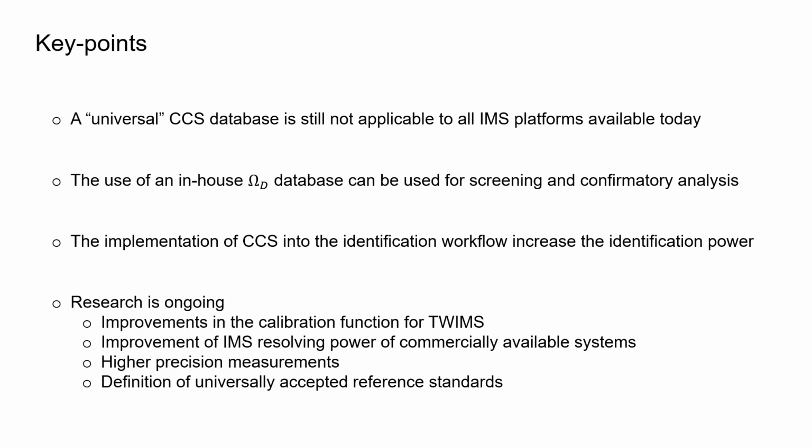Lastly, research is definitely ongoing and significant progress is expected very soon. For example, in the improvement of the calibration equation for the traveling wave, or even a first principle equation for the direct CCS derivation for the traveling wave and TIMS. Improvement of the resolving power of commercial systems is also expected. The recent launches are quite promising in this respect, and this will lead to higher precision measurements. And finally, I believe that the definition of universally accepted reference standards will be undertaken very soon.